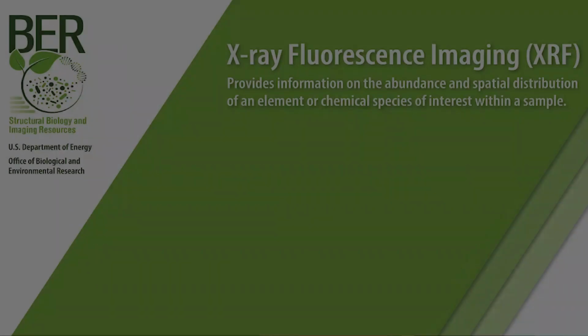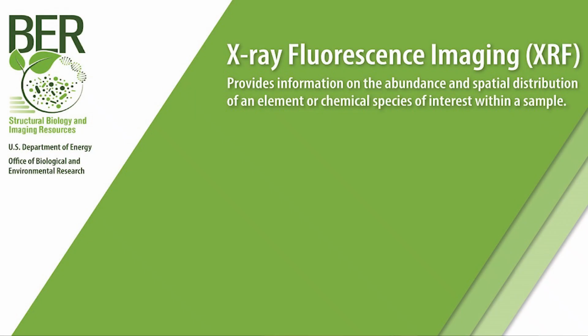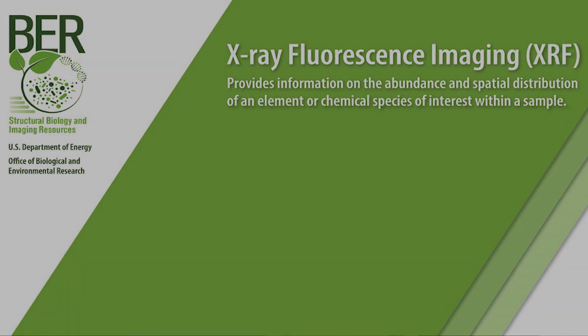Most commonly, XRF imaging is used to observe the abundance and spatial distribution of elements from phosphorus, although sometimes as low as magnesium depending on the abundance, through to heavy metals. XRF imaging beamlines perform X-ray absorption spectroscopy on a small spot on the sample surface. This differs to bulk X-ray absorption spectroscopy, which requires a homogenized sample and a much larger beam.